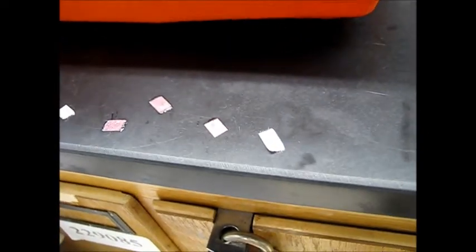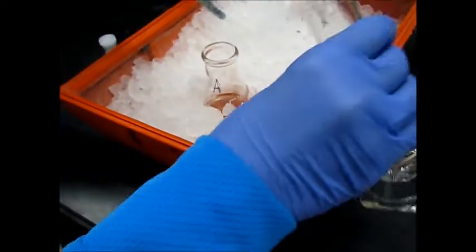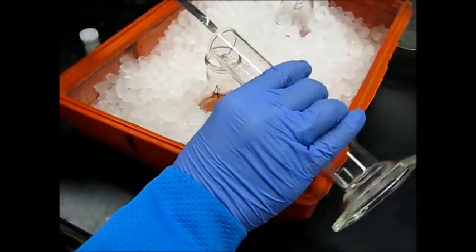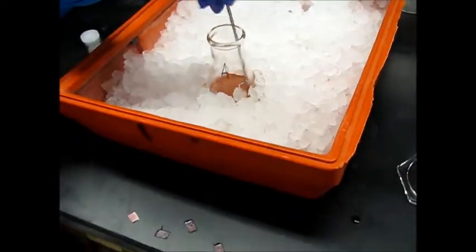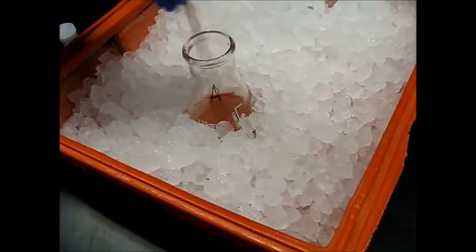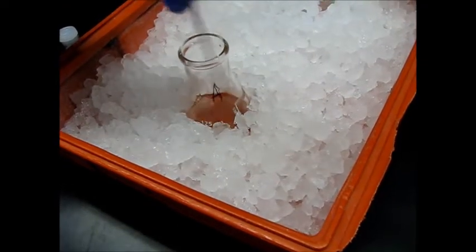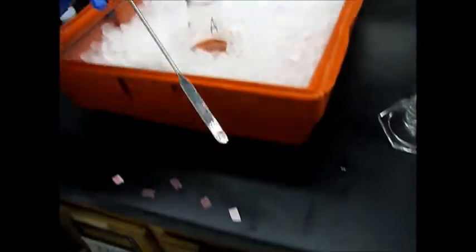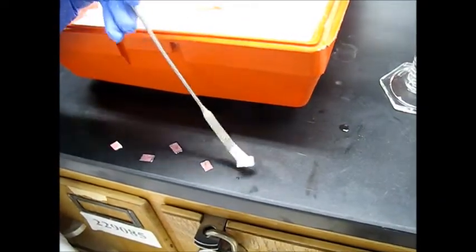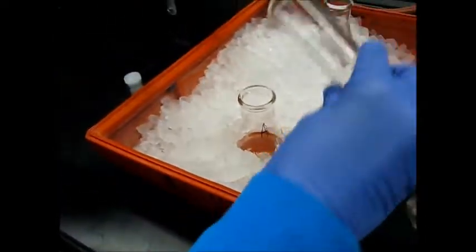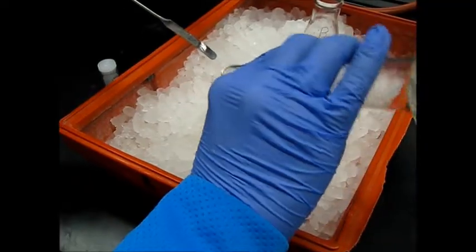Then we can test the pH. It's still pretty red but it is definitely getting lighter. Add some more sodium hydroxide. Test the pH. Still red, kind of pink. I will add the rest of the sodium hydroxide that I have in the cylinder.